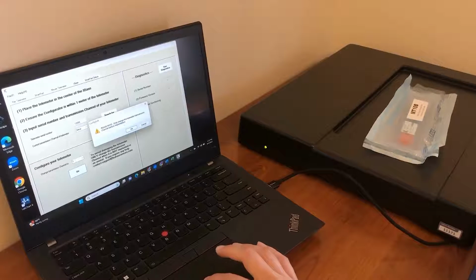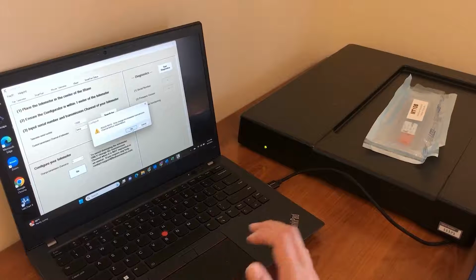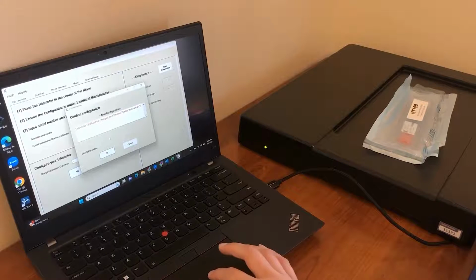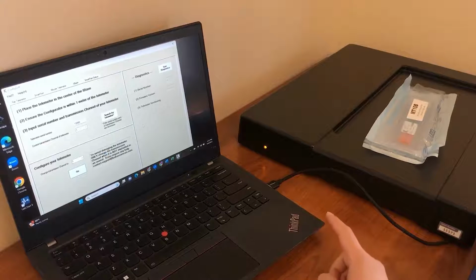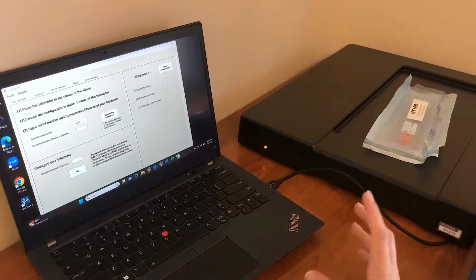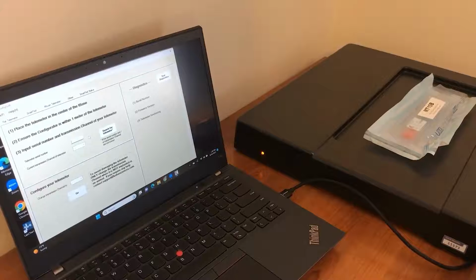This note will come up saying that you'll want to adjust these transmission frequencies or channels before you implant the telemeter into the animal. Click OK, and then confirm your configuration. You'll now see that the light on the tBase is orange because they are on different channels, so they are not able to communicate with each other. The final step of setting up the system involves changing the channel of the tBase so that it corresponds to the telemeter you will be using on that base.